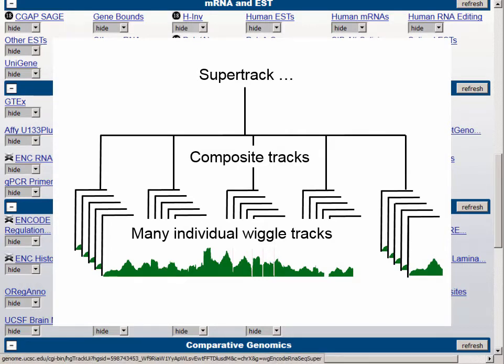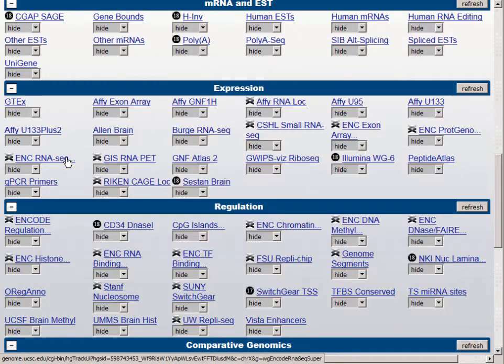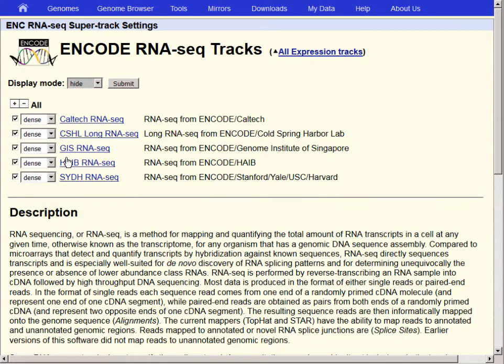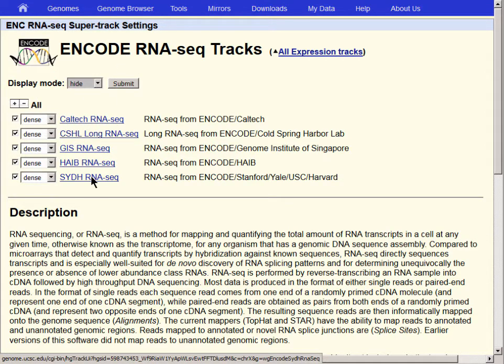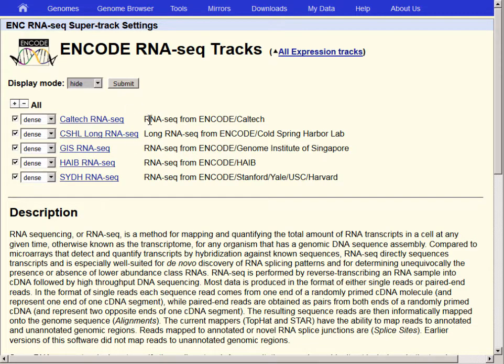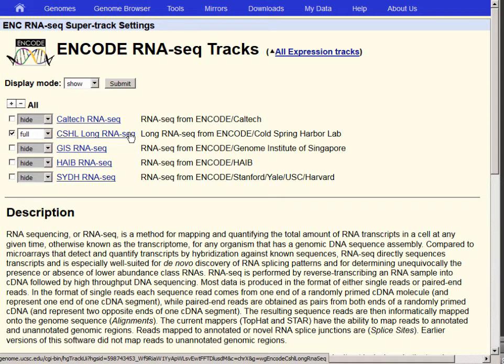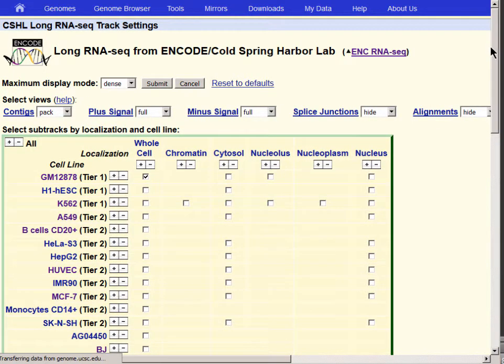This type of track has three levels of control: at the top, it's a super track; in the middle are composite tracks which consist of multiple individual data tracks. Let's click into the link and go to the configuration page, where you'll see the track is set to hide but there are five different composite tracks within this super track. We'll turn all of them off except we'll turn the Cold Spring Harbor Lab long RNA-seq track back on to full. The display mode of the super track switches to show when we change the long RNA track to full. Let's click into this composite track and see all of the individual tracks that make it up.